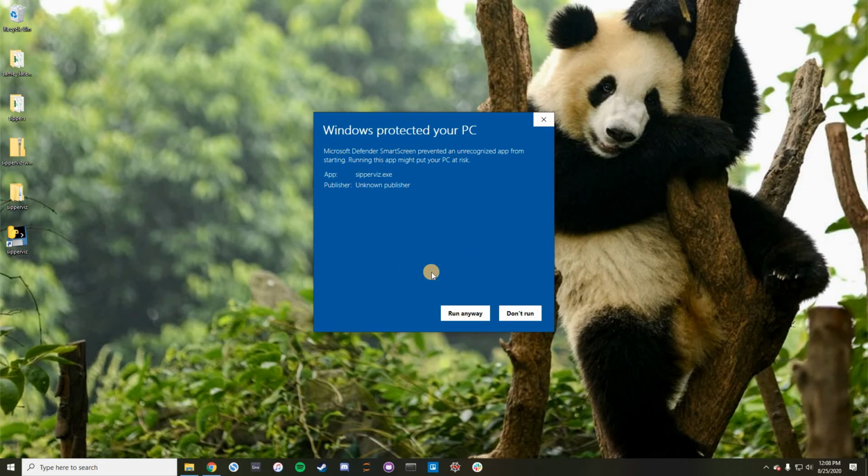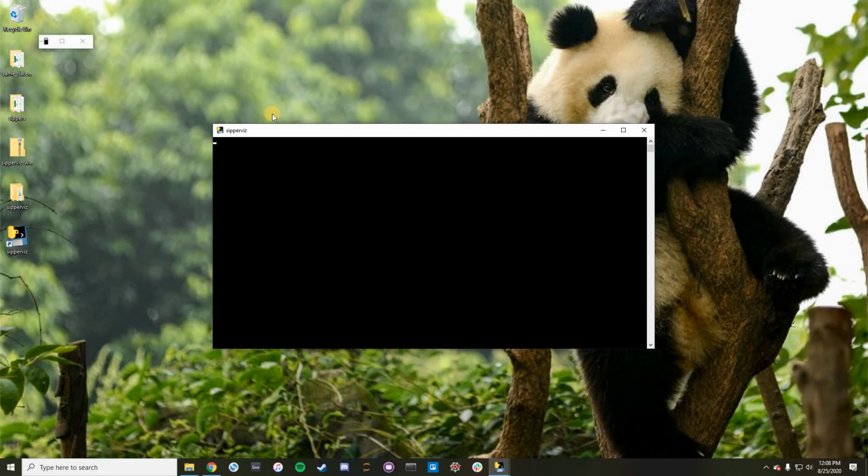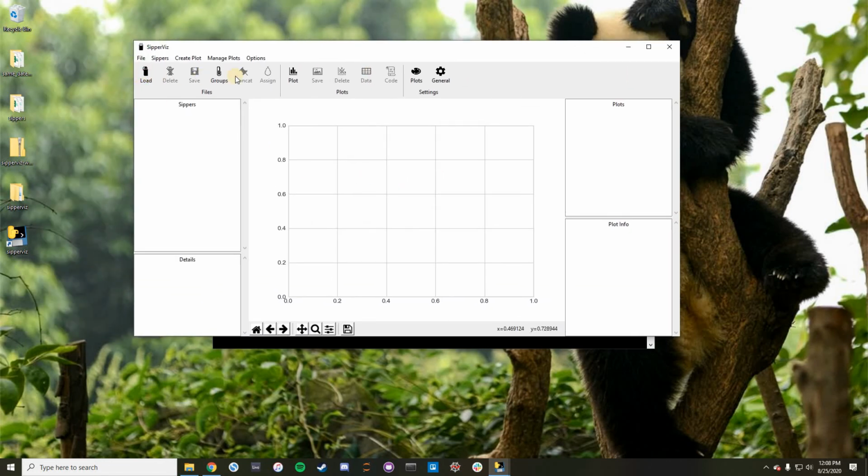If you're on Mac, you might get a pop-up that says it just can't open, and that Mac prevents you from opening files from unknown developers. In that case, you need to go to the system preferences and security, and then there should be an option to open apps from unknown developers. There might even be a link, it knows that you just tried to open this and will let you open it then. Okay, so I'm going to hit run anyway. A console should pop up, and then the application pops up. And yeah, that's ready to go, and it should be working and everything.